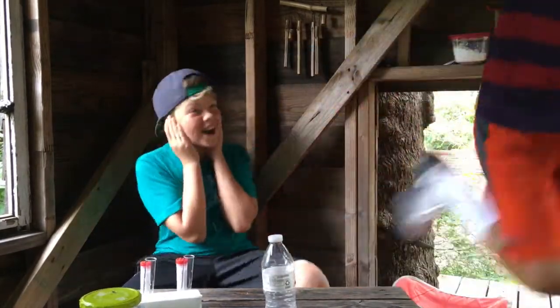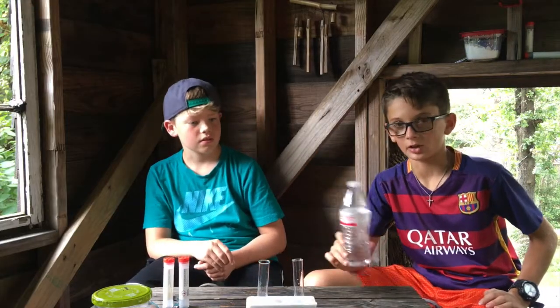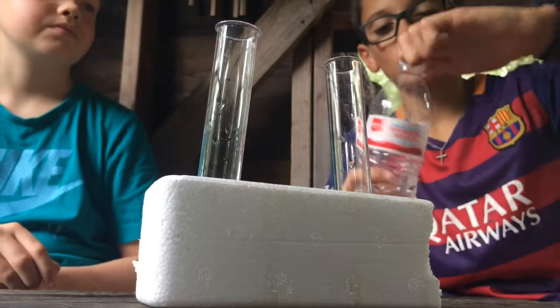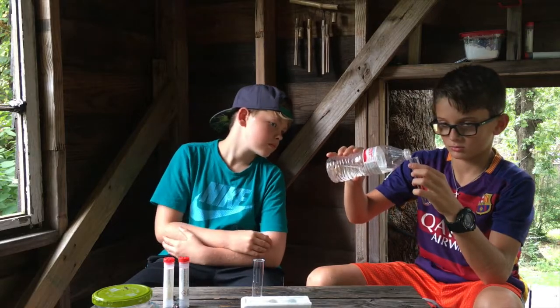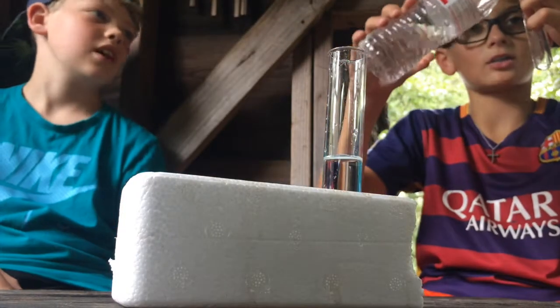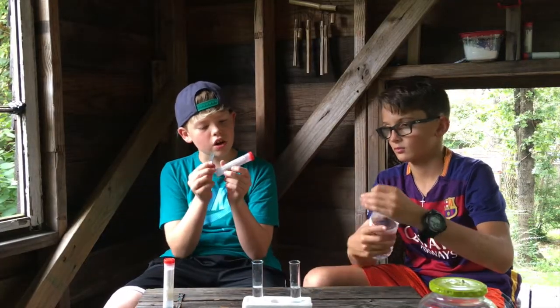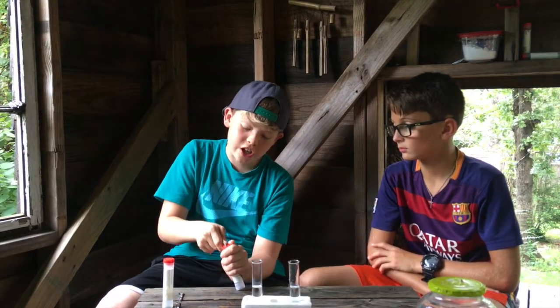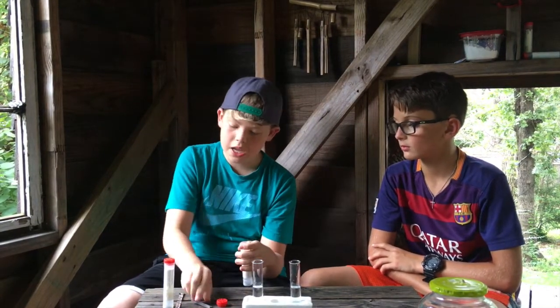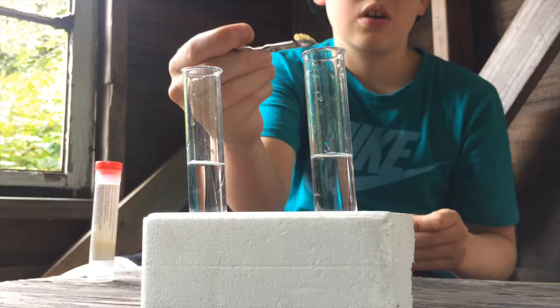First, you're going to take your water and pour half of it into one of your containers. Then you're going to take your ammonium iron sulfate, open it up, and take one spoon of it and put it in that container.